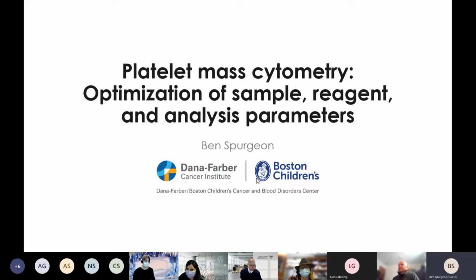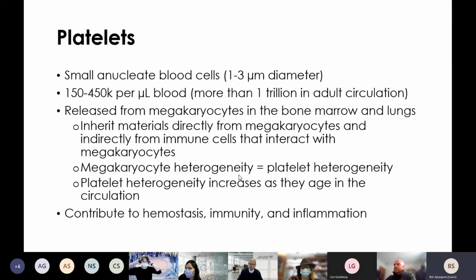I'm Ben Spurgeon, and I'm a postdoc at the Center for Platelet Research Studies at Boston Children's Hospital. We use a variety of different techniques to examine platelets, and we're currently using mass cytometry to explore platelet heterogeneity in health and disease. In today's presentation, I'm going to talk you through some of the work we've been doing on this.